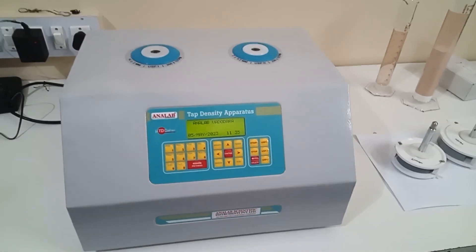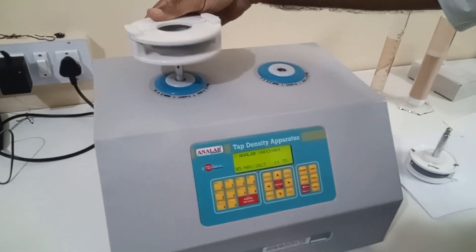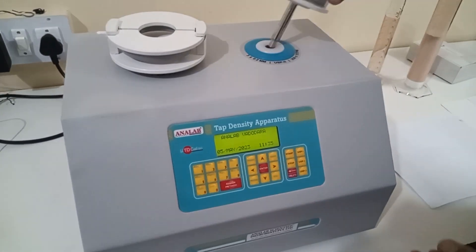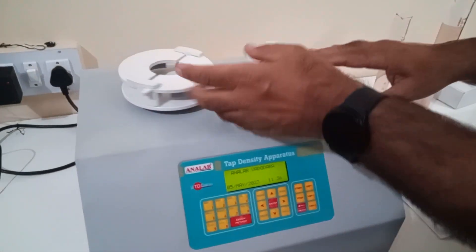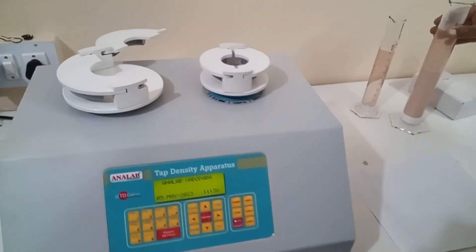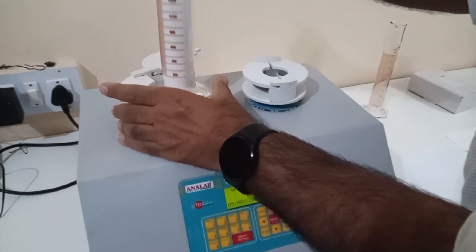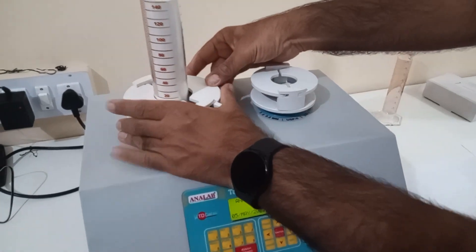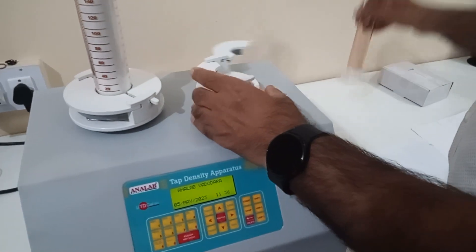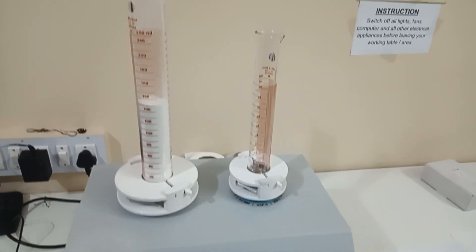Now we will install the accessories one by one. This is the first holder of 250 ml, and this is the second holder. As you can see, the first measuring cylinder is being installed now. Now we will install another one — the 100 ml measuring cylinder. We need to install the cylinders this way.